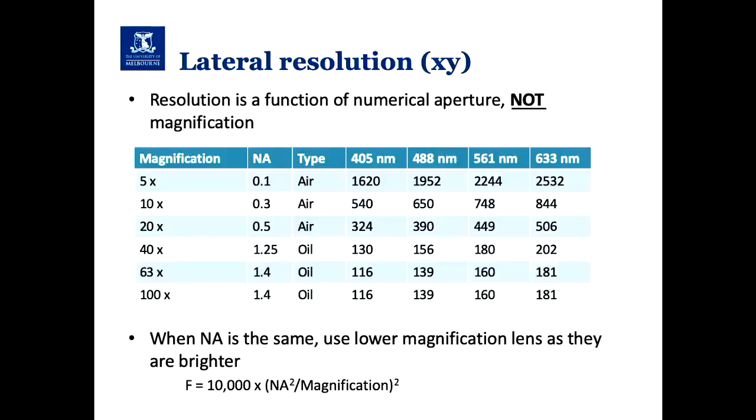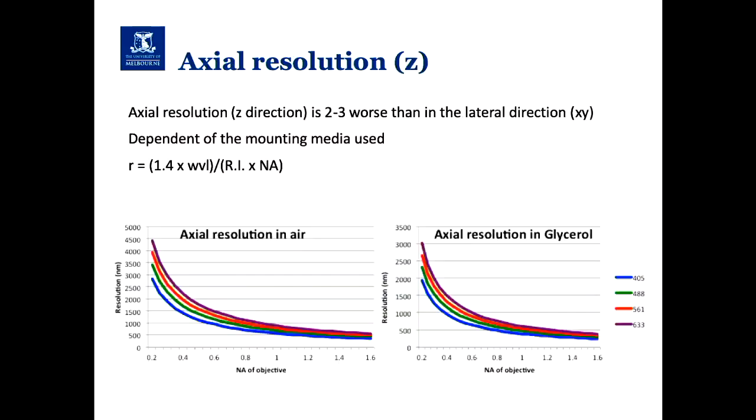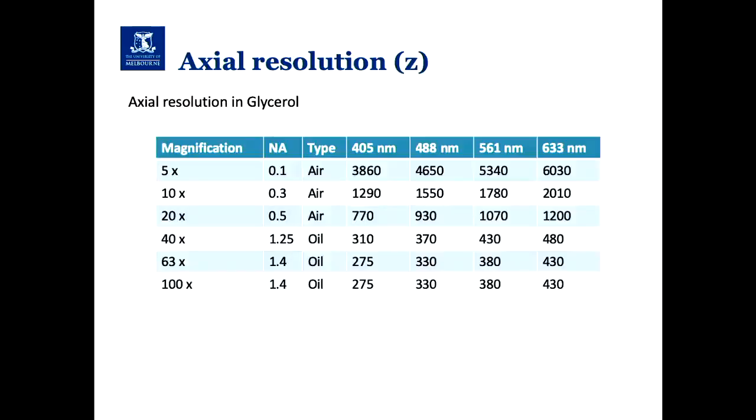So now you can refer to these and say, this is my resolution. If I'm trying to sample and get the best quality image, I need to make sure my pixels are 3 times smaller than that number. Does that make sense? We'll cover this again on Thursday.